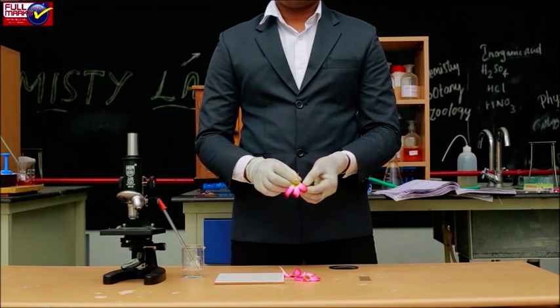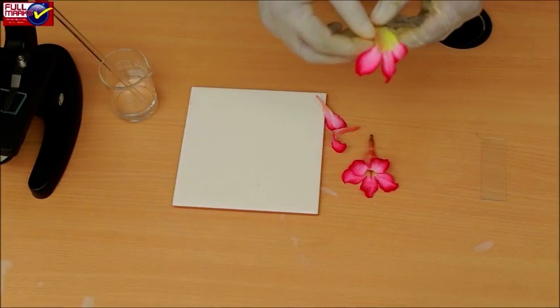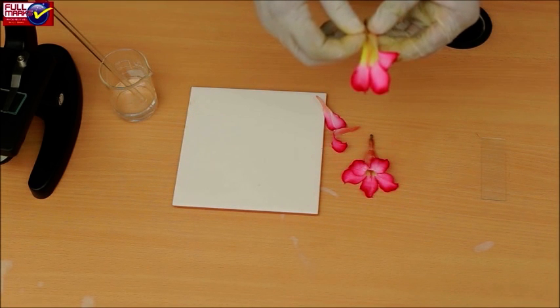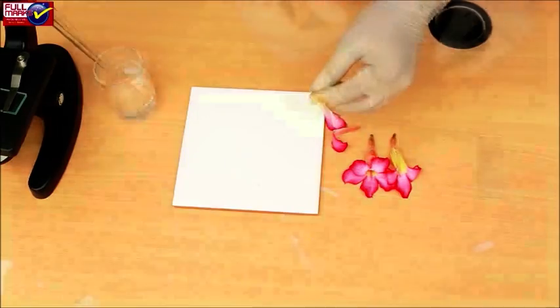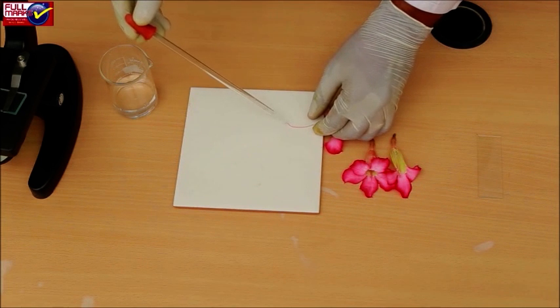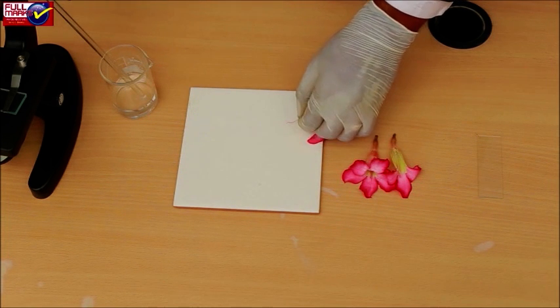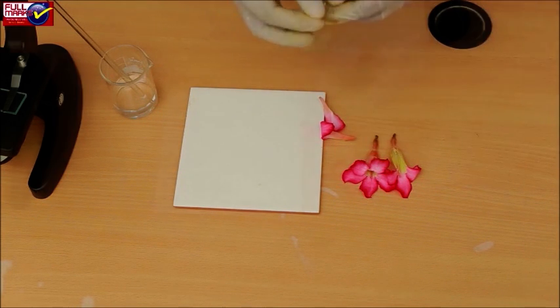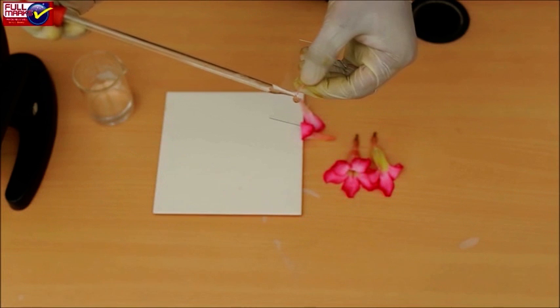Take out a pistil from a fresh, open, mature flower of portulaca or any other different plant. Stain the isolated stigma with safranin stain. Mount the stained stigma in glycerin and place a coverslip over it.